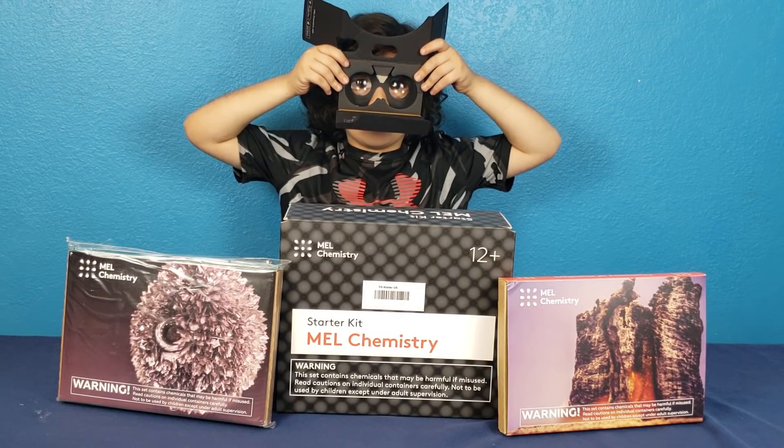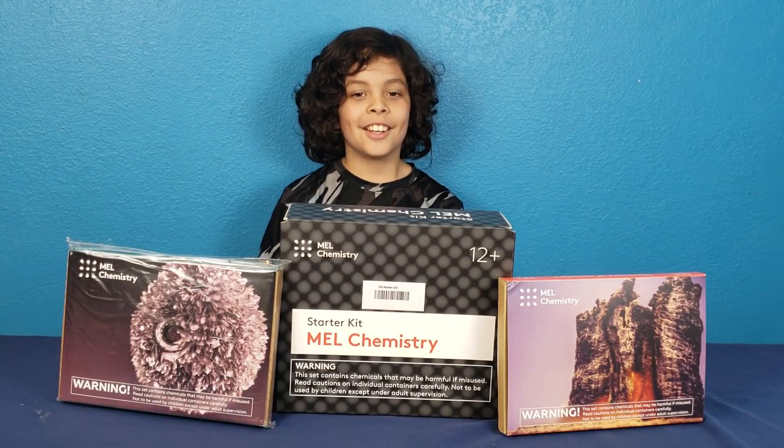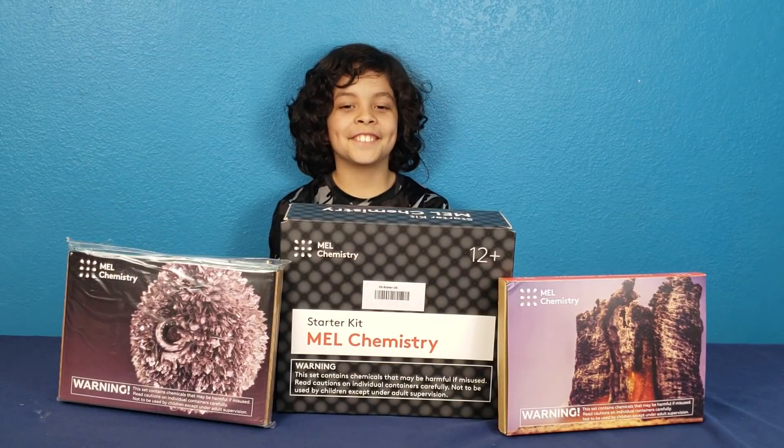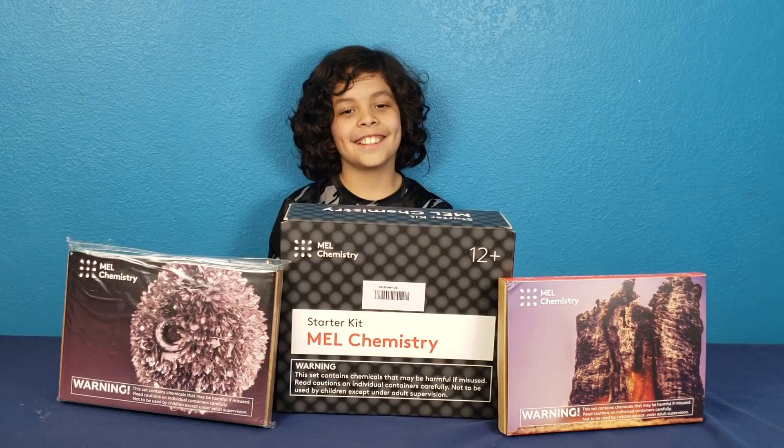This is a great alternative to school labs, recommended for children 10 plus. Over 30 chemistry topics, and shipping is free in the US.